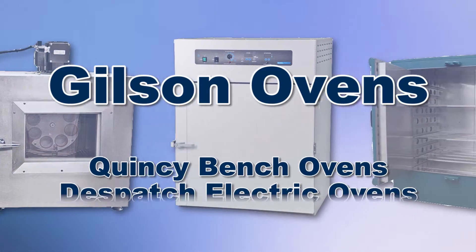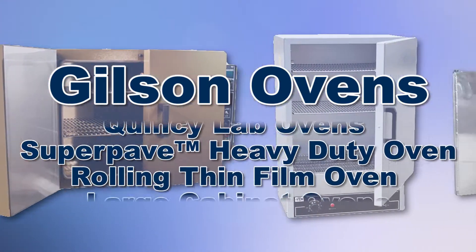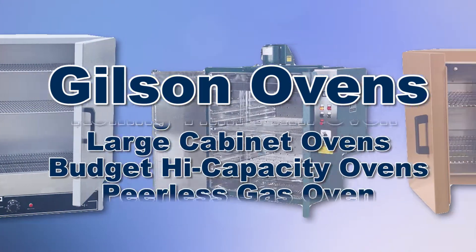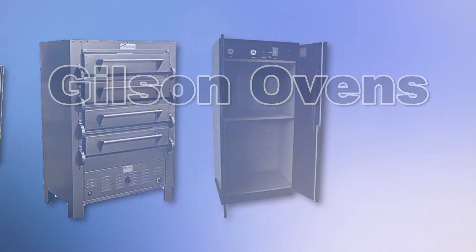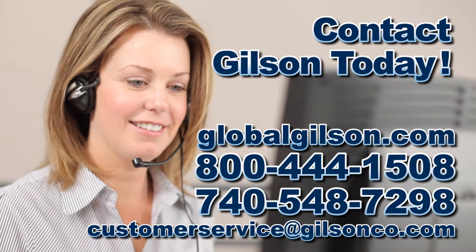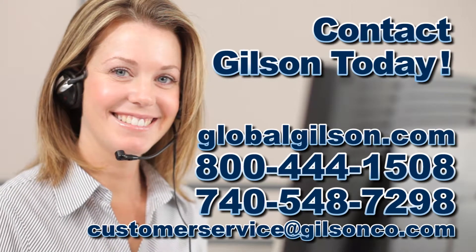With Gilson's complete family of lab ovens offering a wide range of performance, features, and capacities, Gilson has the right equipment for your accurate materials testing needs. Be sure to check out these and all our products listed in the Gilson catalog and on the Gilson website.